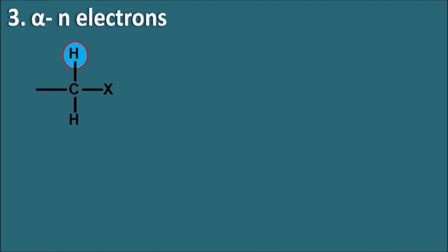Here you can see the protons which are attached to the carbon having a heteroatom, and this heteroatom is having the n electrons. So such type of protons are going to fall in the range of 2.5 to 4.5. This heteroatom may be either oxygen, nitrogen or halogens, whatever may be. All these are electron withdrawing groups which will increase the chemical shift by their de-shielding effect.